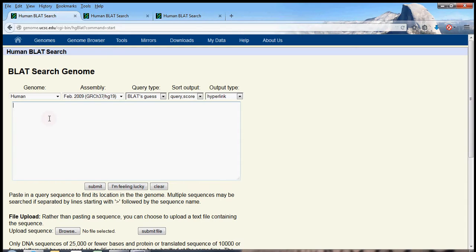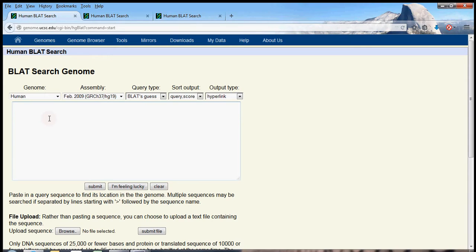BLAT has some incredible algorithms behind it, and I really would like to make a video about those algorithms later on. But for now, just consider that BLAT takes in a sequence of nucleotide letters. It has to be at least 20 nucleotide letters long, and it will search for that sequence somewhere within the 3 billion base pair human genome.